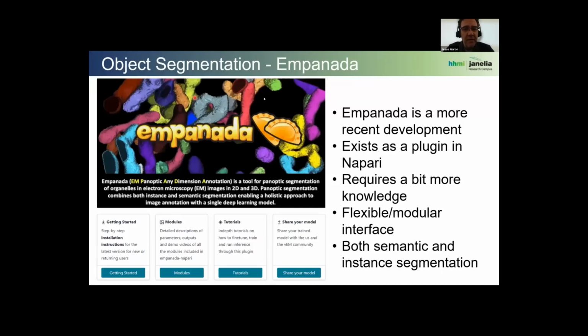And so for anybody that's not familiar, Napari is another open source image viewing software that was particularly supported by the Chan Zuckerberg Initiative. But it was originally kind of meant to be a competitor to ImageJ. I don't think it's going to be that anytime soon, but it is a commonly used image viewing program out there that is freely available.